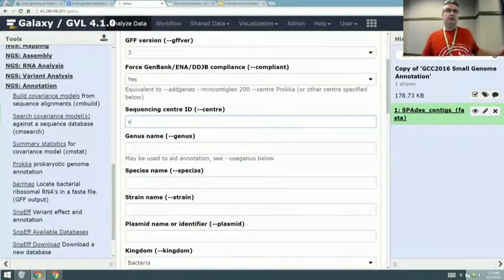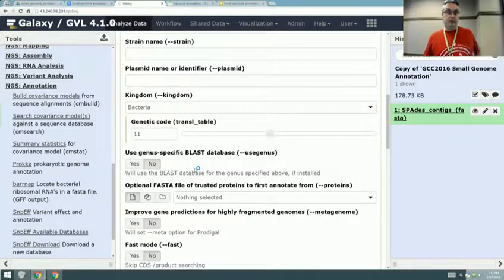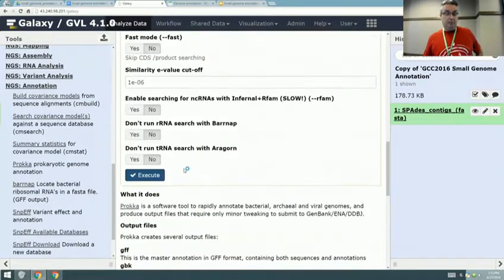So don't blame me, I didn't do the interface for this tool. This one's a little bit old now, but we are going to redo the interface to make it a bit simpler. It's a bit complicated at the moment. We're just going to hide everything behind an advanced tag and just have the minimum stuff.